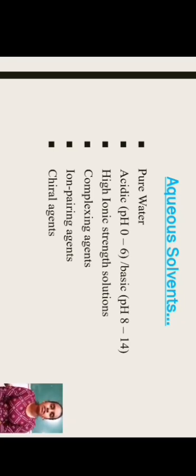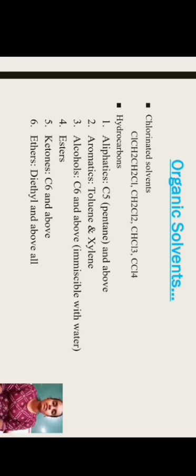In solvent extraction, aqueous solvents are taken as pure water, acidic pH in the 0 to 6 range, basic pH in the 8 to 14 range, ionic strength solutions, complexing agents, ion pairing agents and chiral reagents. Organic solvents are taken as chlorinated solvents and hydrocarbons: aliphatics, C5 pentane and above, aromatics, toluene and xylene, alcohols, esters and ketones, C6 and above, ethers, diethyl and above.